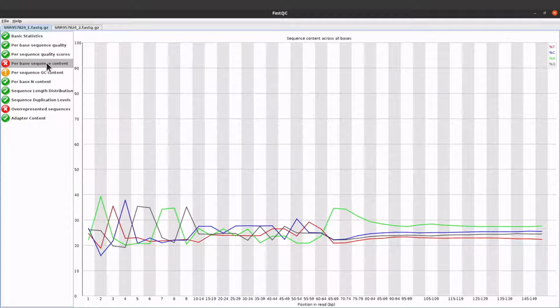If it's red, that means that something is wrong, or probably something unexpected has happened. And so FastQC will raise this alarm for you by giving this color here. So you just have to check and then see what is happening. Of course, sometimes it can be red, but it doesn't mean something is wrong. So you just have to know what's happening. You just have to understand your data, and then that will help you to really confirm if something is wrong or not. So that's about it.